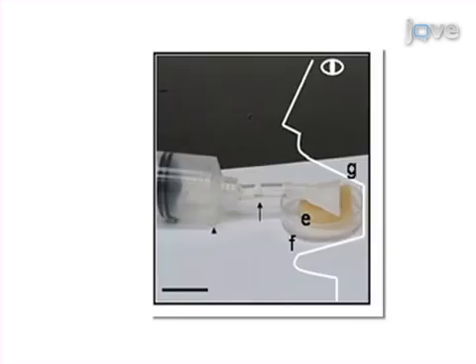In order to mimic the human oral environment, a sponge is soaked in saliva. Using a syringe, the saliva is filtered and collected via the connected tube.